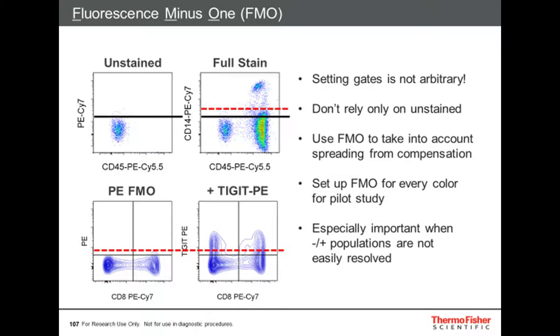Setting gates is not arbitrary, and I can certainly not set gates any better with 30 years of experience than you can. I use the proper controls as well. Don't want to rely on the unstained.